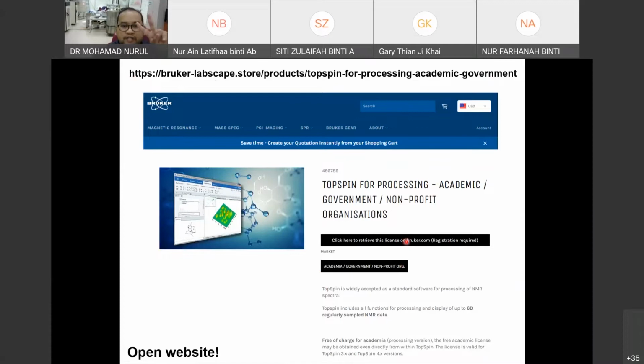They have 2 versions here, 3.6.2, which is quite an old version, and they have the 4.0 series. It's up to you which one you want to install, but I prefer 3.6.2. I'm not opening the website here because I don't remember my key, as it is on my laptop at my office.